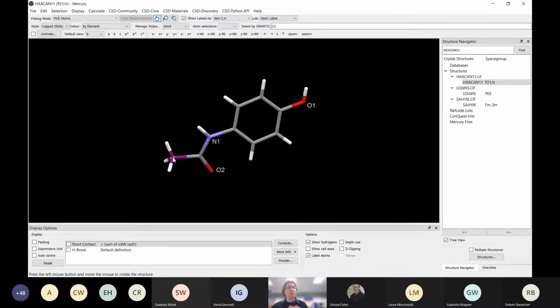So if you want to specify an atom or in fact the whole molecule, we can always change the color. And if you're unhappy, we can always go back. One of the other things is we've got color by element up here, yet another tab, and that will reset all the atoms to the colors based on the elements, rather than anything we changed. So you can go around and change colors to anything you want, just so it stands out.